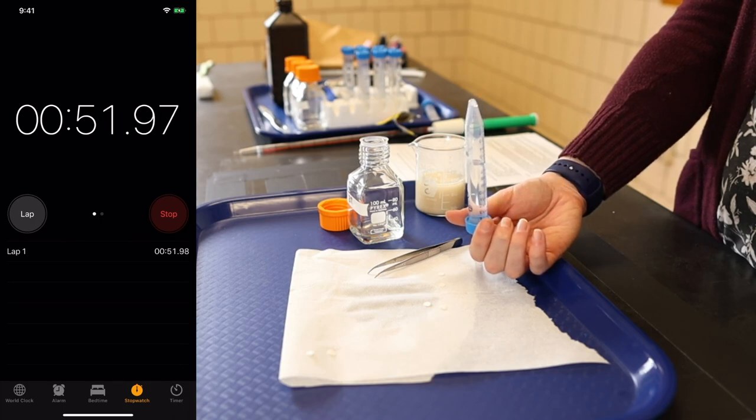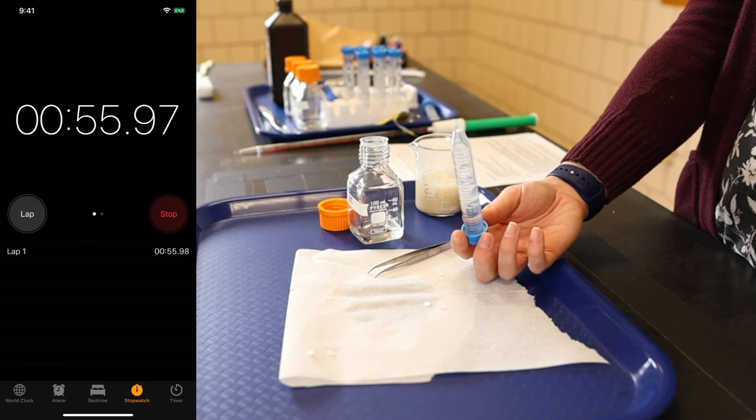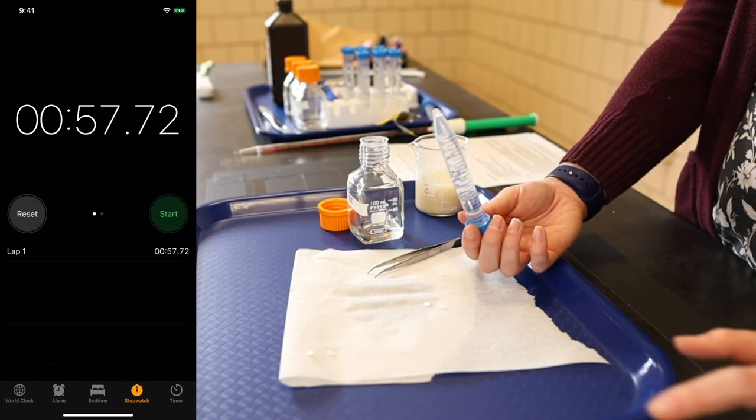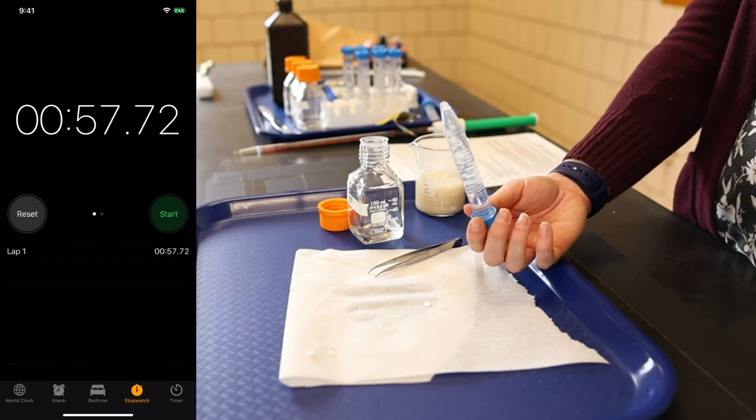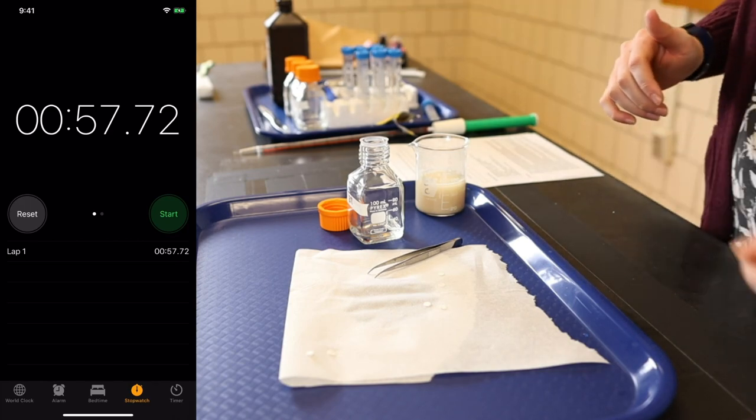The last trial of 0.375% seems to be moving a little bit faster — 57 seconds, just over. Write that value down on your table.